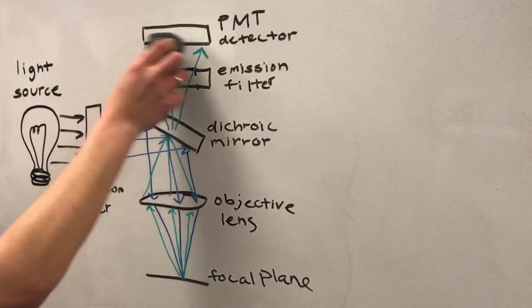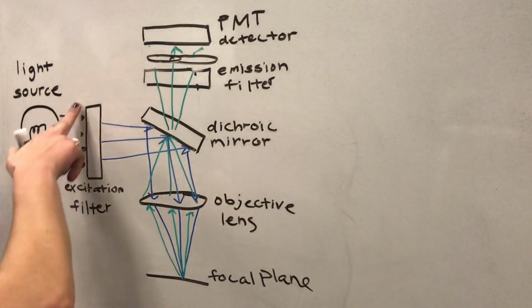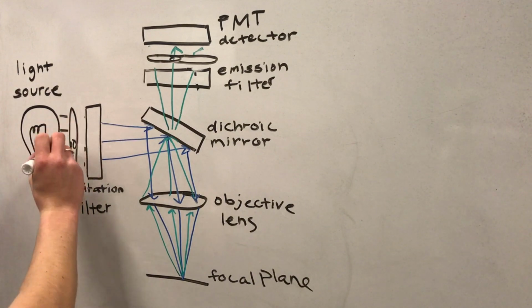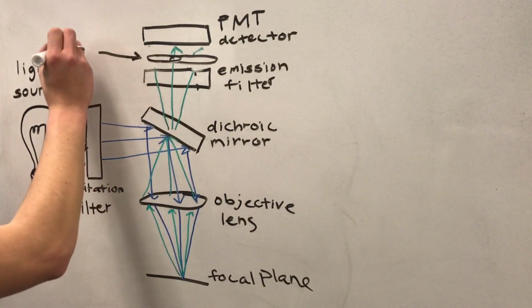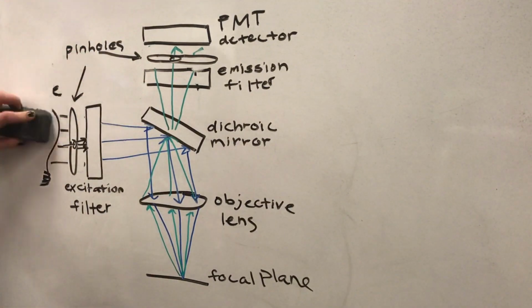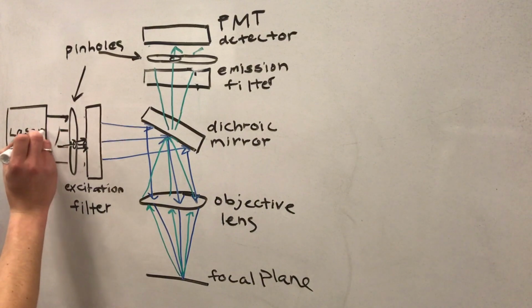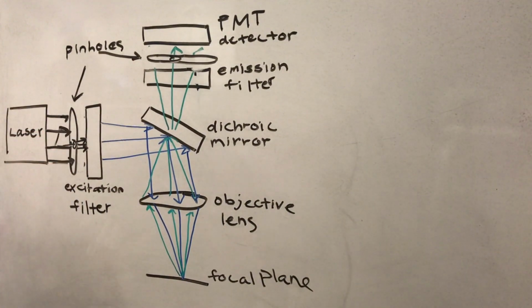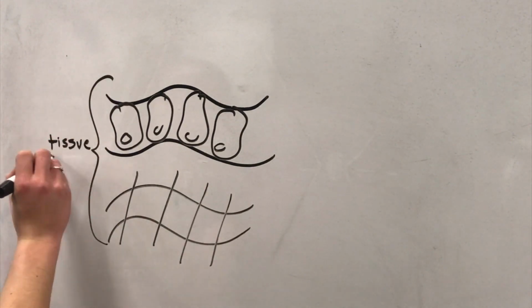Confocal microscopy uses a focused laser beam as the light source and adds a pinhole in front of the detector to address this issue. The pinhole blocks out-of-focus light during image formation to produce a clear image. However, confocal microscopy still uses high-energy photons, which lead to phototoxicity and photobleaching and ultimately reduce the viability of living tissues. Additionally, penetration depth is limited by light absorption and scattering in samples.